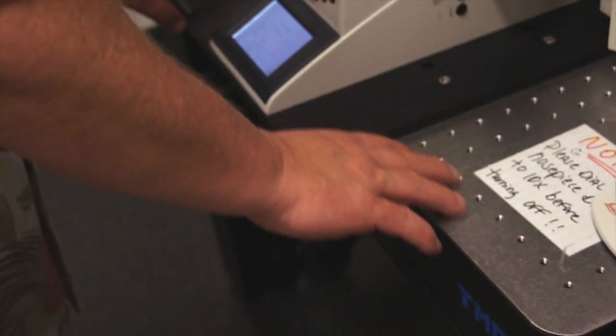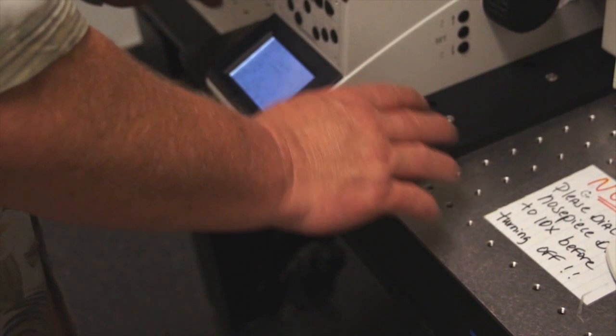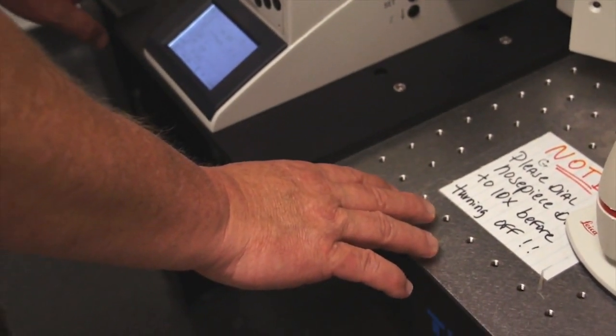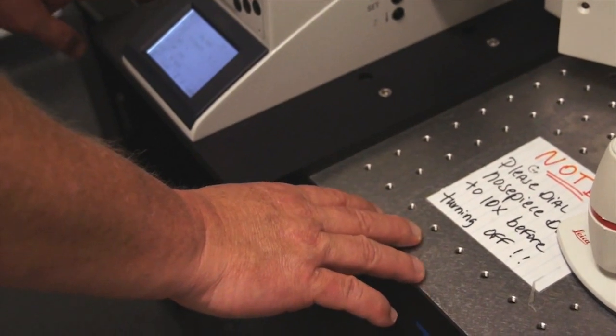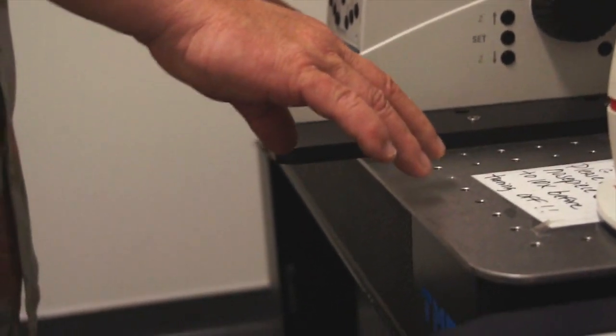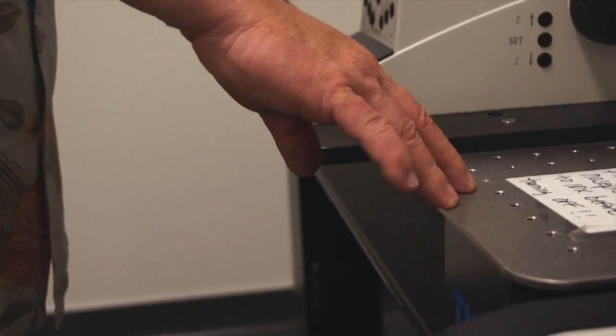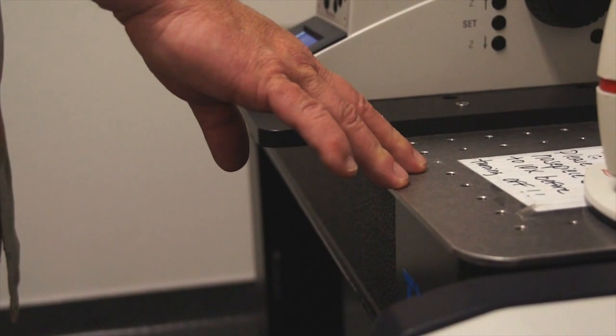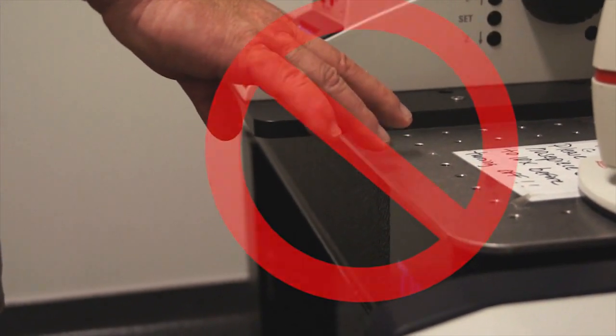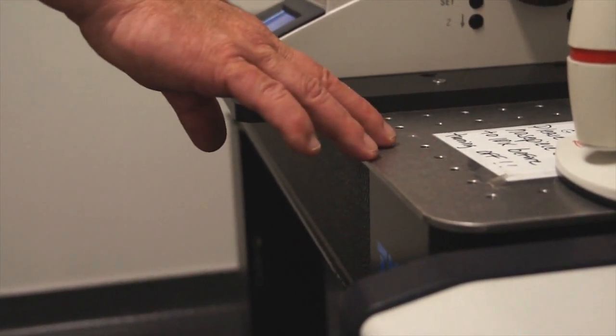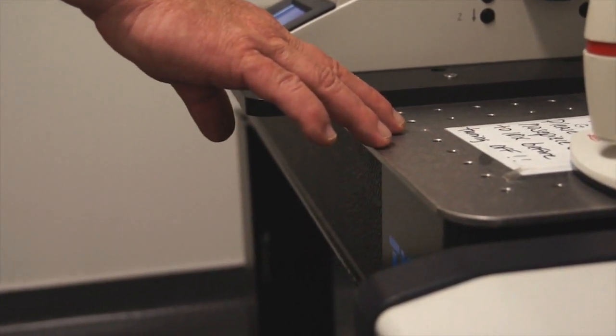Please understand that the table that supports the microscope is an air table. It's designed to reduce any vibrations that come from the building or traffic outside. If you press on the table, it will decompress and come back up. But we don't want people leaning on the table because that over exercises the air pump that keeps the air under the table in order to reduce vibrations.